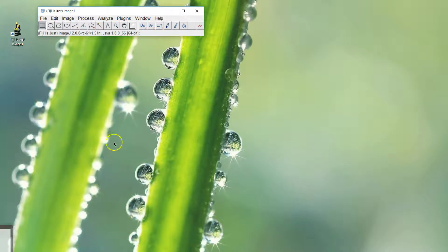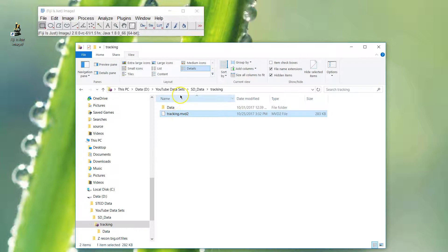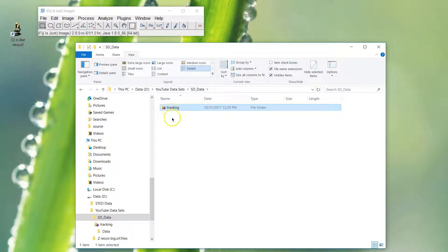Okay, so we're going to do a couple of Fiji tutorials today with the Velocity Poconelma velocity software that we have on a couple of our spinning disks. The folder comes here with a little icon, and this is the Velocity icon here.